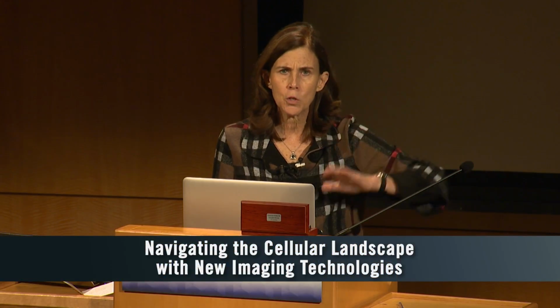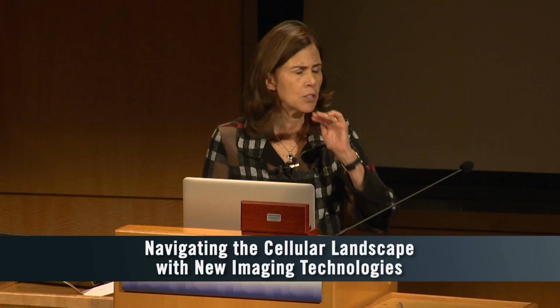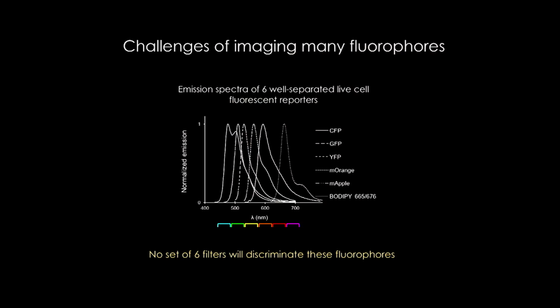We can see them clearly with electron microscopy, but if we do fluorescent time-lapse imaging, we're limited to imaging 2 or 3 of these organelles at one time because of this problem of overlap in emission spectra among the different fluorescent proteins that are available. So here we have classic fluorescent proteins that have different emission spectra, CFP, GFP, YFP. These are the emission spectra for each of these different fluorescent probes. And the problem is their emission spectra are overlapping.